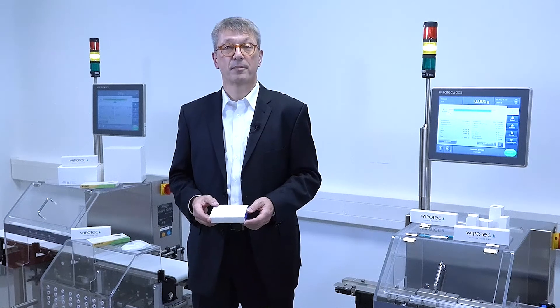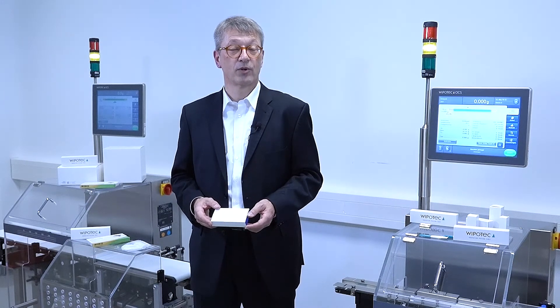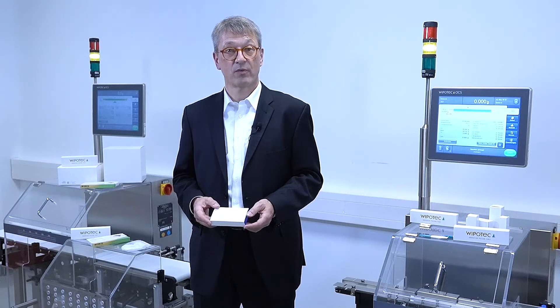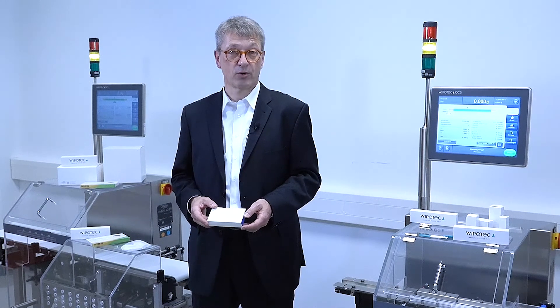Engineering is the base for machine building. From a standpoint of pharmaceutical companies, there is a strong demand for good validation documentation. That is another area where we are very well prepared, and where our customers are very happy with our comprehensive IQOQ documentation.